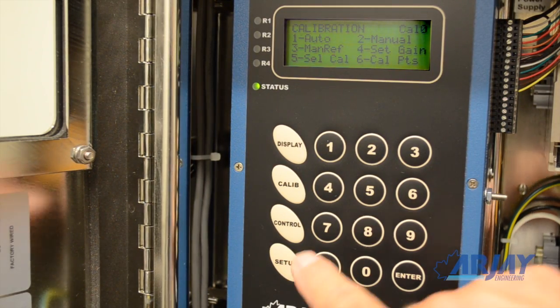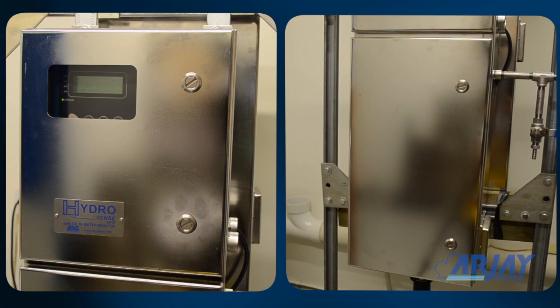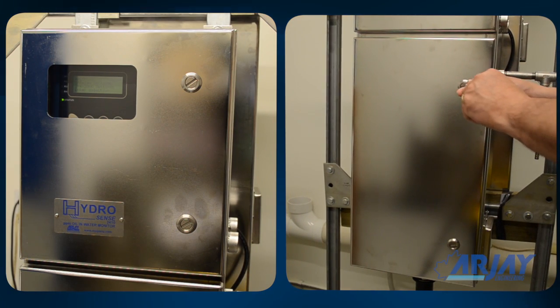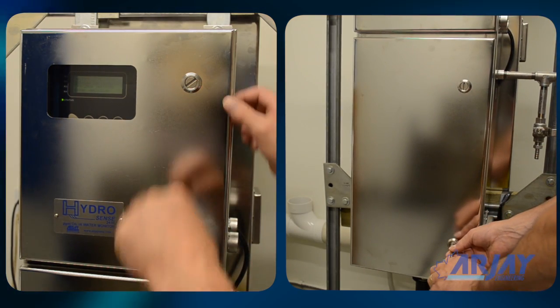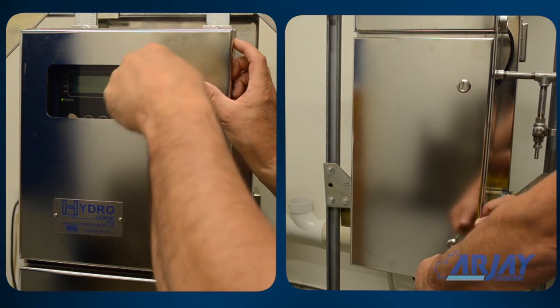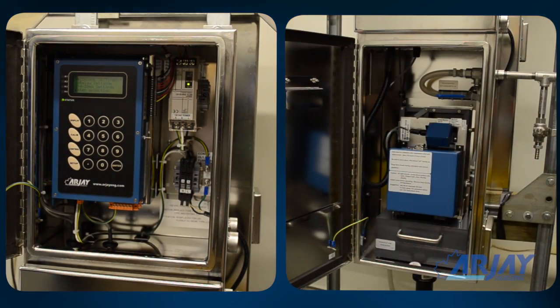The relay set points and output ranges can be changed at any time and simply entered through the keypad. Maintenance is even easier. Routine cleaning will be necessary at a frequency determined by your site conditions. The power and flow does not need to be turned off. In fact, it is best not to. Also, no tools are required.